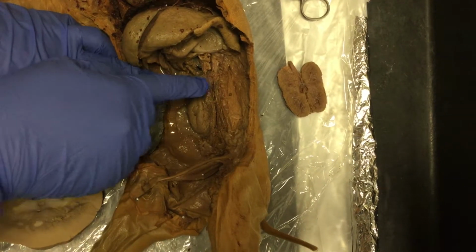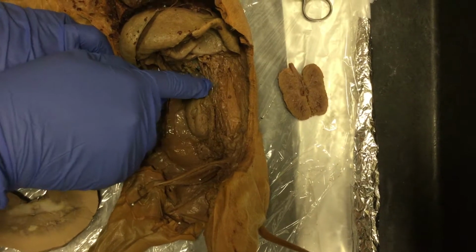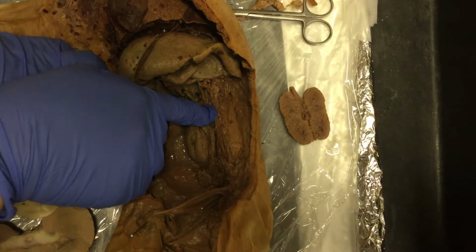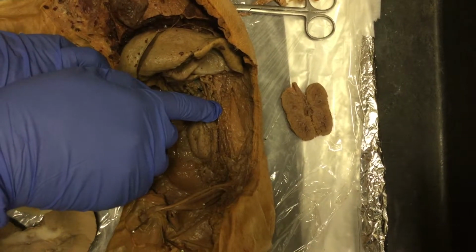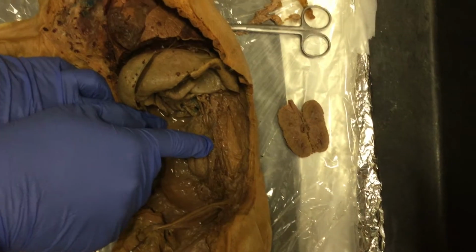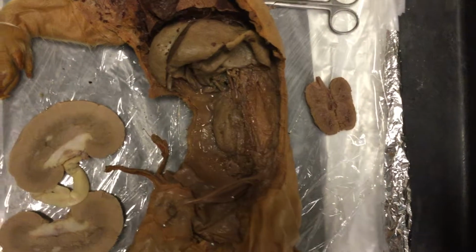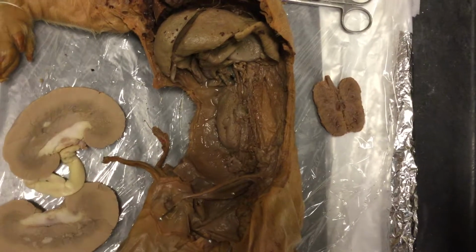So we have the inferior vena cava right here, this structure. Again, the renal vein would be around here or around here. We even see the blue marking in this area where the kidney is missing. So that would be where the renal vein would be, and then the renal artery would be down here or over here also. And then we also have the aorta, which is the largest artery in our body.